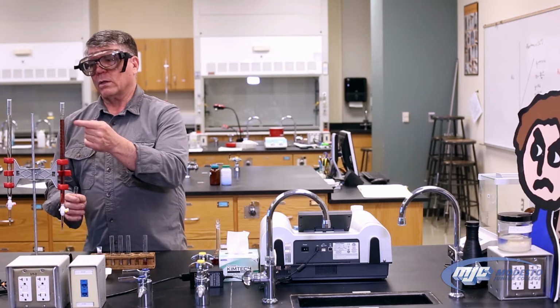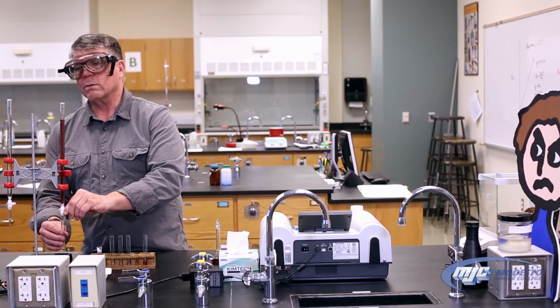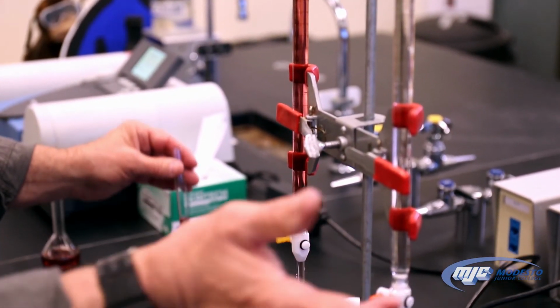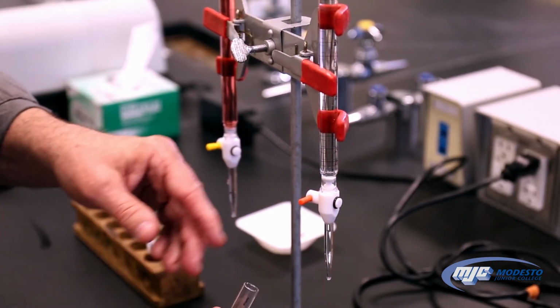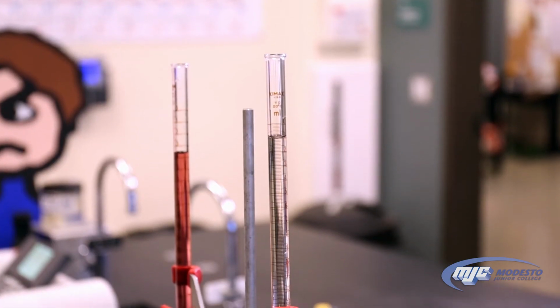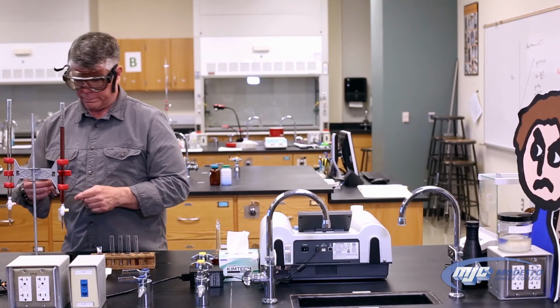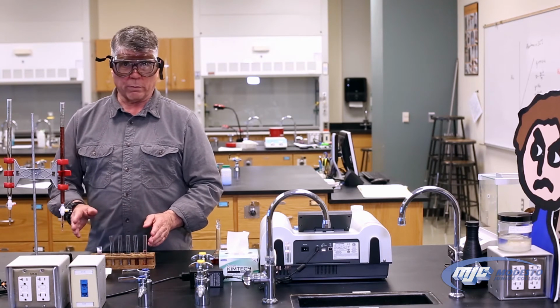Test tube 2, whatever we're at now, we're going to add 2 to that number. Add till we get to about that, close the stopcock, read the new volume, and so on for 3, 4, and 5. Then we do the DI the same way. Test tube 1, we want about 4 mils of DI, so read our initial volume, add 4 to that, just get about there. Record our final volume here. That's test tube 1, and so on for test tubes 2, 3, 4, and 5.